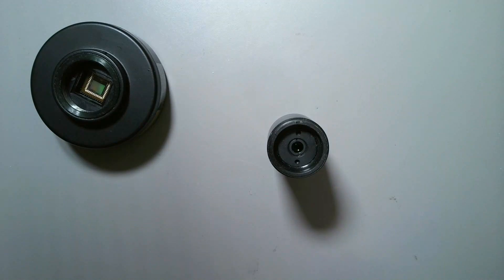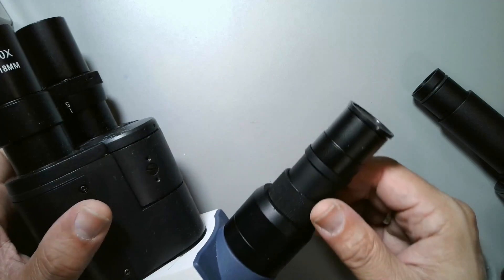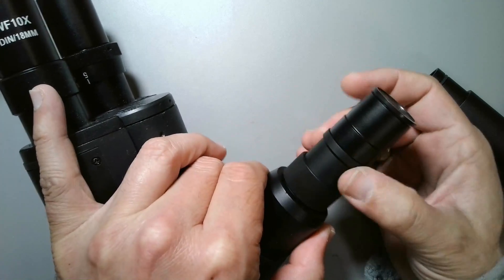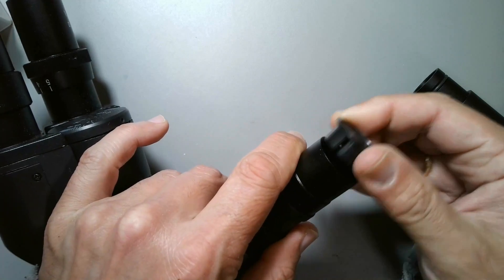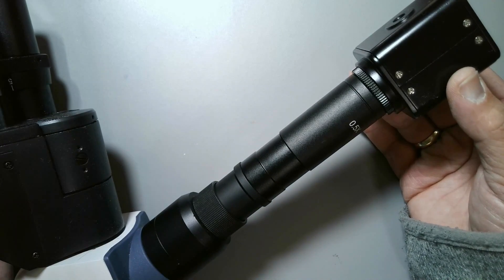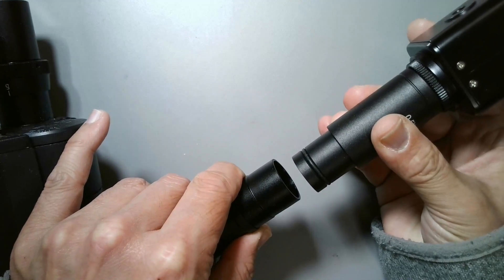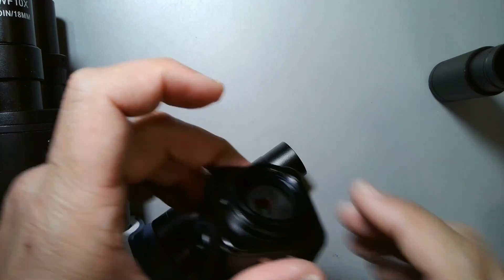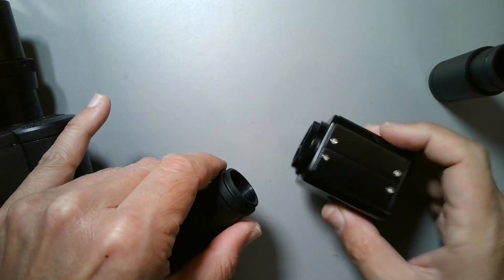Those older USB cameras are also relatively slow, which is another reason I decided to use a newer HDMI camera. It's also possible to connect the camera directly to the C-mount of a photo tube without any reduction optics. My photo tube can be extended and pulled in and out, and the top part can be used to directly plug in the camera. I'm going to show that you can connect it directly by removing the top part of the photo tube to access the threading.